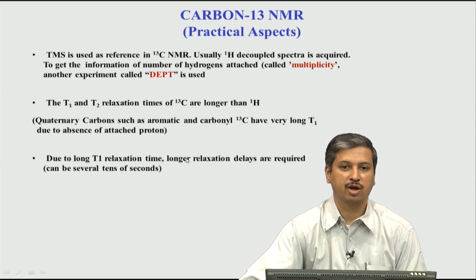So, practically what happens is, we do not worry about this 5 times relaxation delay, because this long relaxation is only for the case of those carbons which do not have any attached proton. Those carbons which have protons attached will have a short relaxation. So, that is the whole problem.